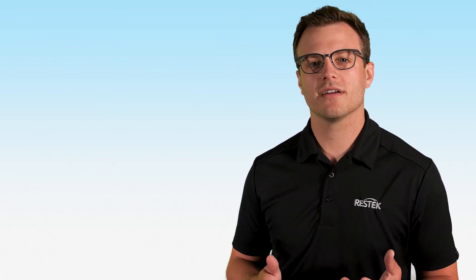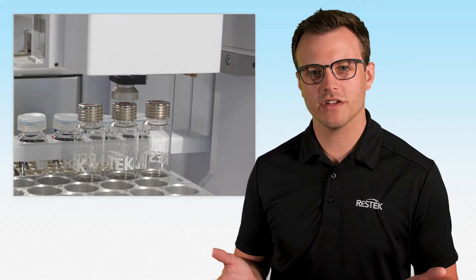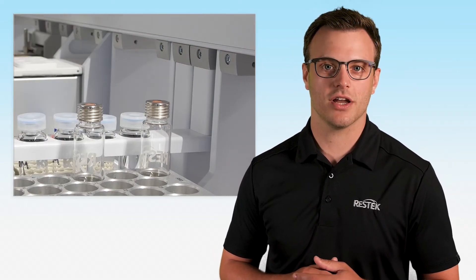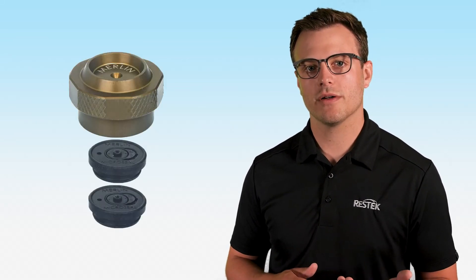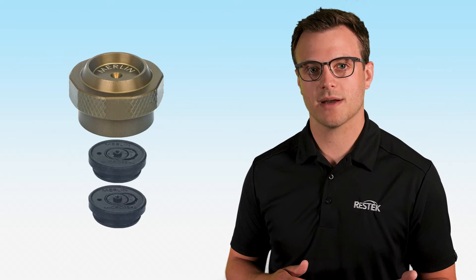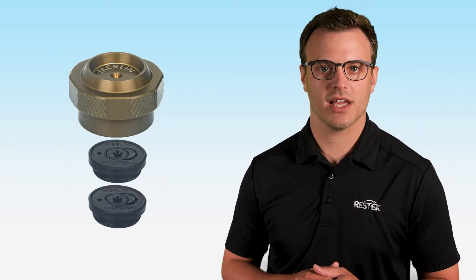You may be wondering: if I want to run a non-SPEMI Arrow application, will I need to change all these parts back? The answer is no — your new septum nut and weldment will be completely fine. However, if you're using a Merlin micro seal instead of a traditional septum, you will need to change that to the correct style for your next application. In addition, you may also want to change your inlet liner to the appropriate geometry.